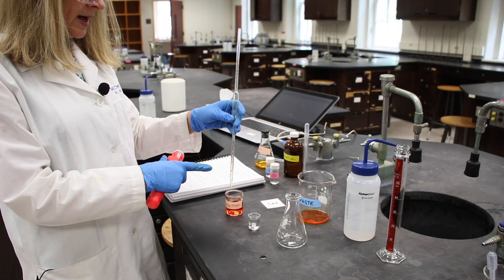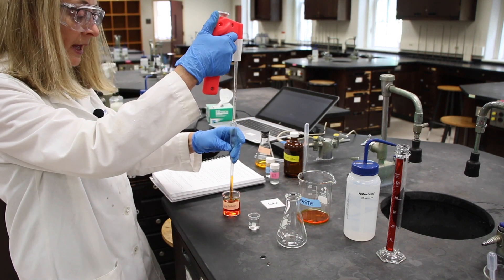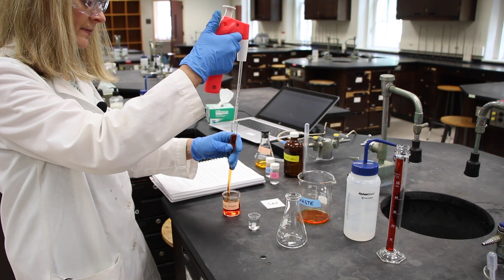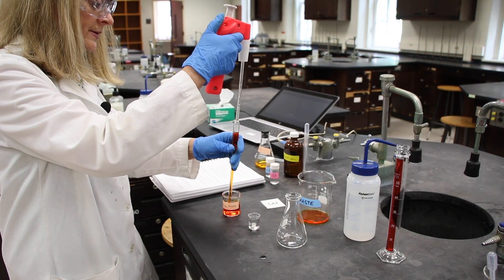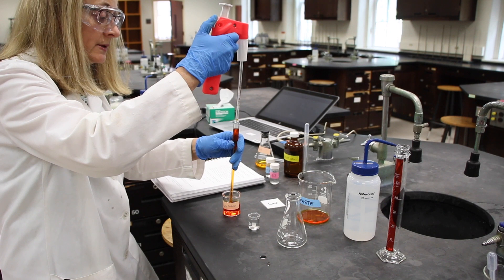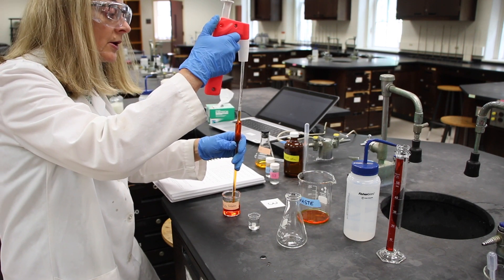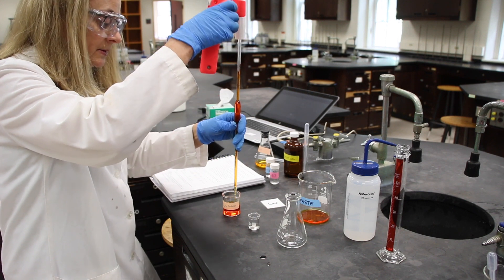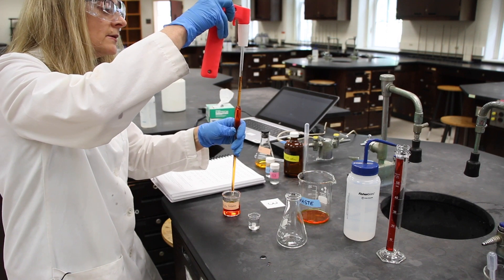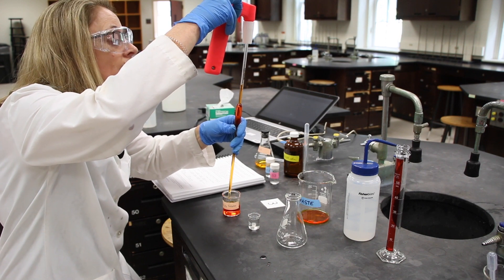Now that I've normalized my pipette, I can now pipette a 10 milliliter sample into my Erlenmeyer flask. All of this potassium dichromate solution — anything that contains it — must be put in a waste beaker, and at the end of the experiment we are going to dispose of that in hazardous waste. Chromium is a very toxic compound and cannot go down the drain.